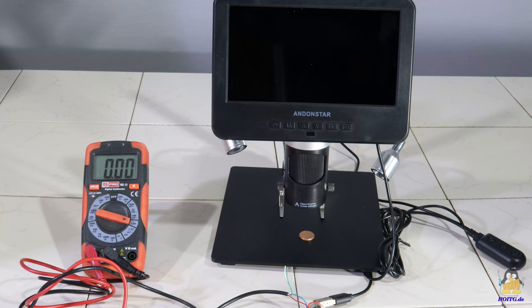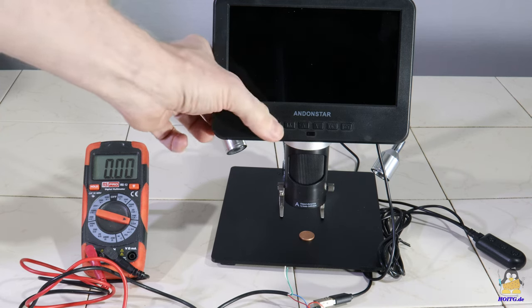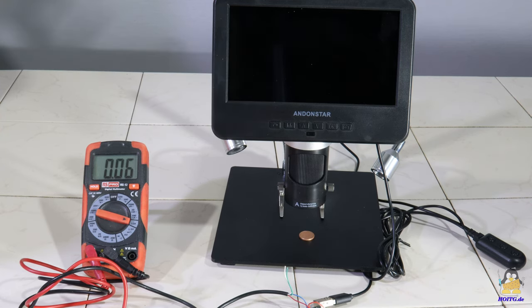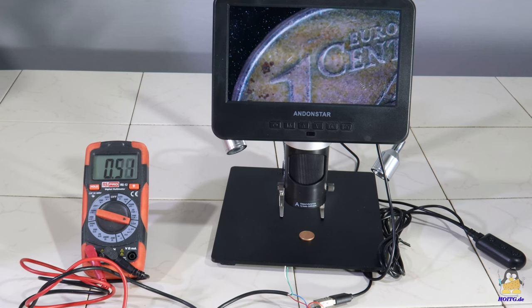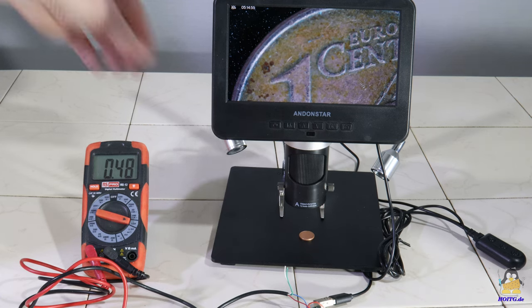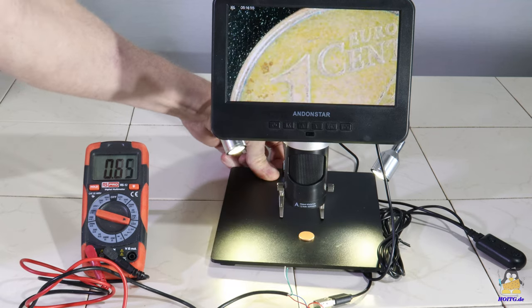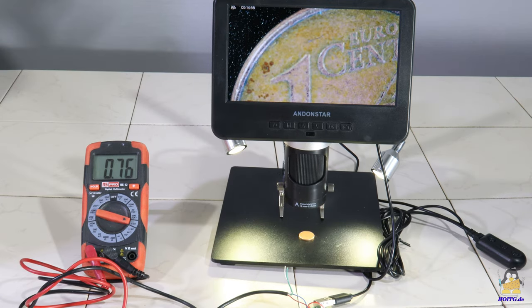The microscope is ready for use in a few seconds after switching on. The live image of the camera appears on the screen. The microscope draws a current of 480mA. With the lights at maximum brightness, the current is 750mA. With that, the microscope can be operated for several hours via a power bank.